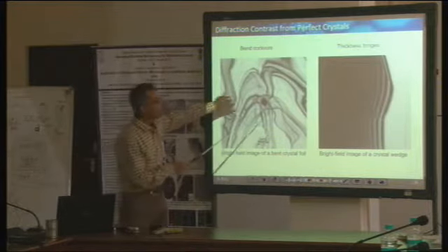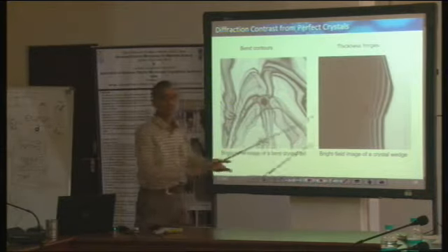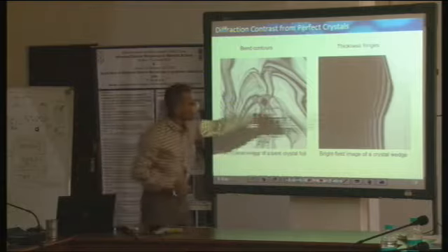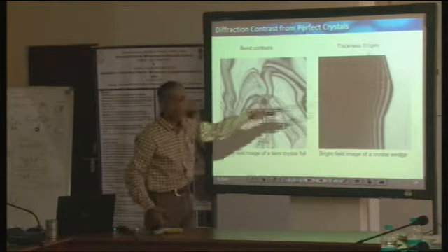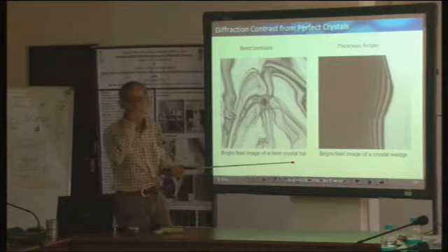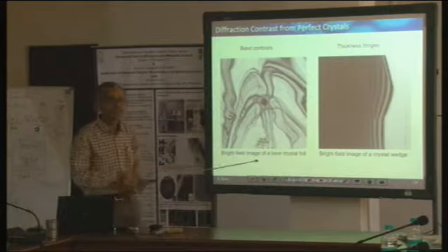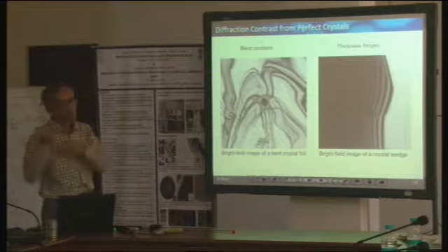Okay, so bend contours, this is how we have eliminated bend contours. Still I see some contrast in this image. Why? Again, I still have a perfect crystal. There should be no defects. Why am I seeing these fringes here then? Is there some strange defect in the form of fringes in my material? It cannot be. This would be very strange, isn't it? When I say I don't have any, there is no defect. In fact, these are called thickness fringes, and they also occur due to diffraction which is taking place, and we will study that also.